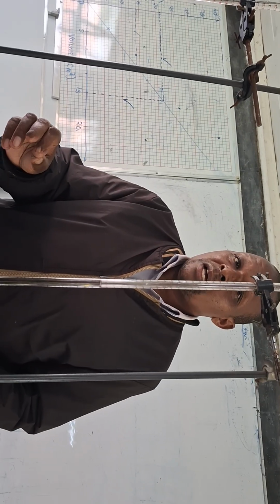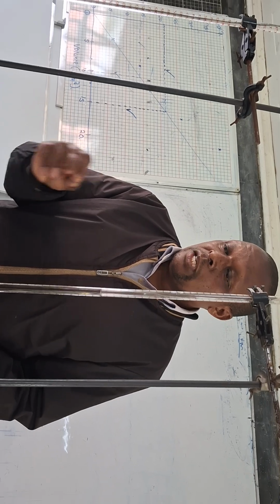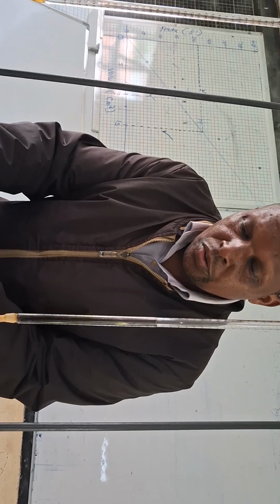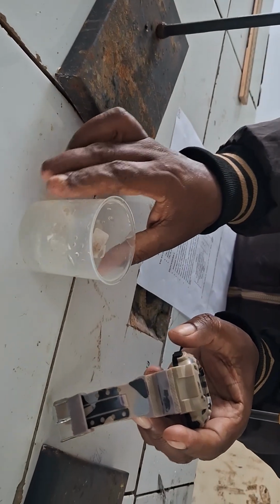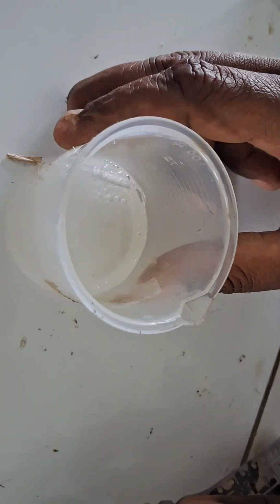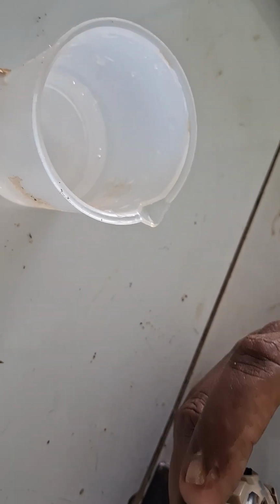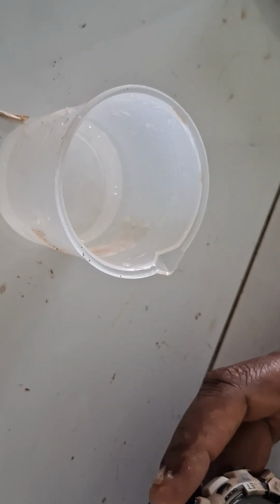You want to see how much time it is going to take for the reaction to reach completion. So we are going to drop and start at the same time. Focus it there. We see the time it will take for it to reach completion.